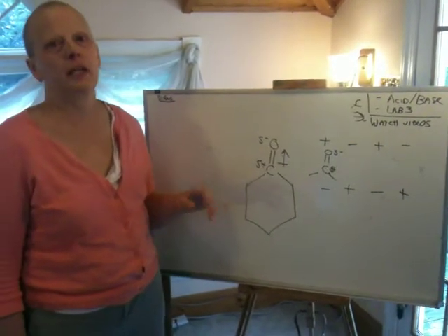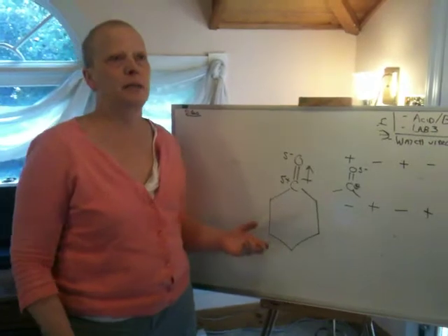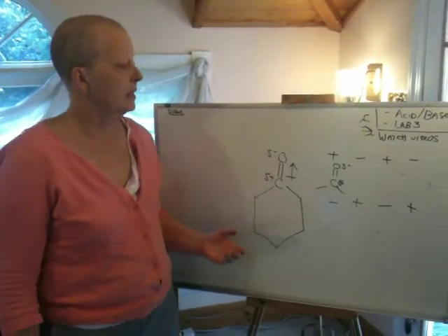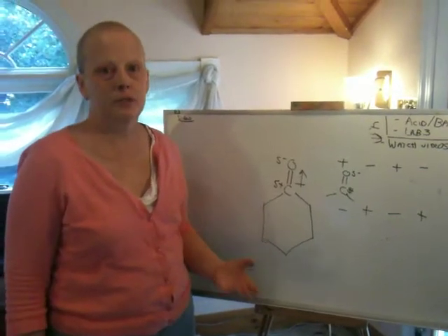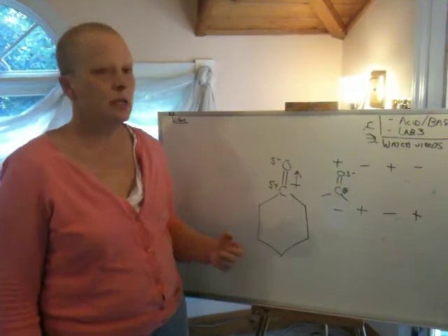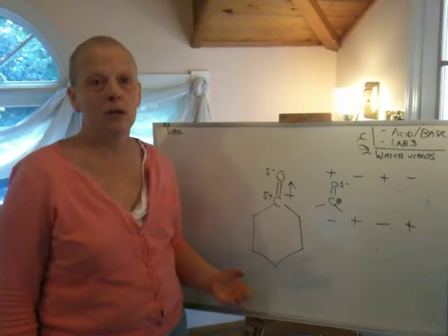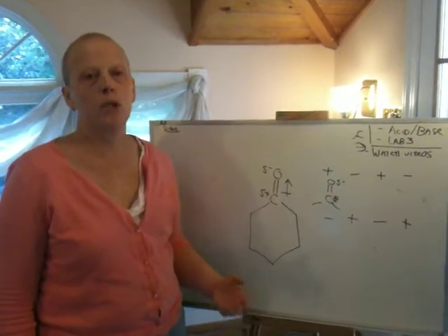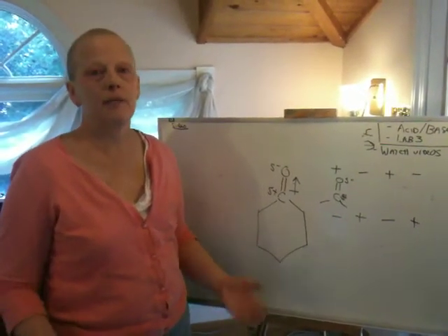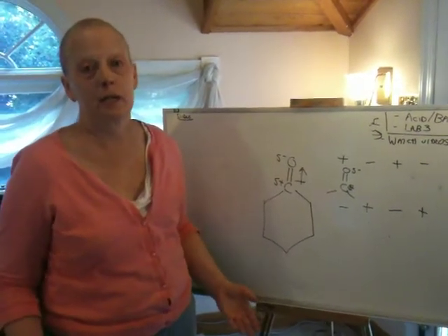What I was explaining was how there's this problem with IR. It's not really a problem, but again, it's kind of like a too much information problem, in that the intensity of the absorptions is related to the number of bonds absorbing, but also, and it probably has a bigger impact, the polarity of the bond. So when you have a bunch of CH bonds, it'll have a big absorption, but that's mainly because there's a lot of CH bonds in organic molecules.